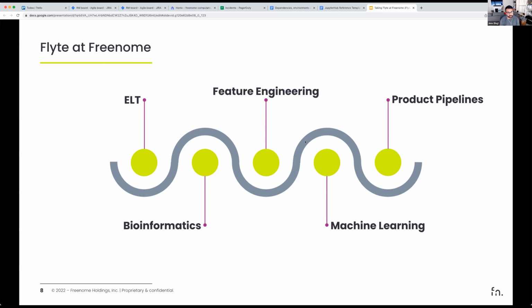Pre-processing our molecular data into a form that we can run feature engineering on, like generate features, and then run machine learning, right? So hyperparameter optimization, training and inference. And then a small subset of all the work that we've done in research up to this point makes its way into our product pipeline. And that's where we're actually running against real test orders.